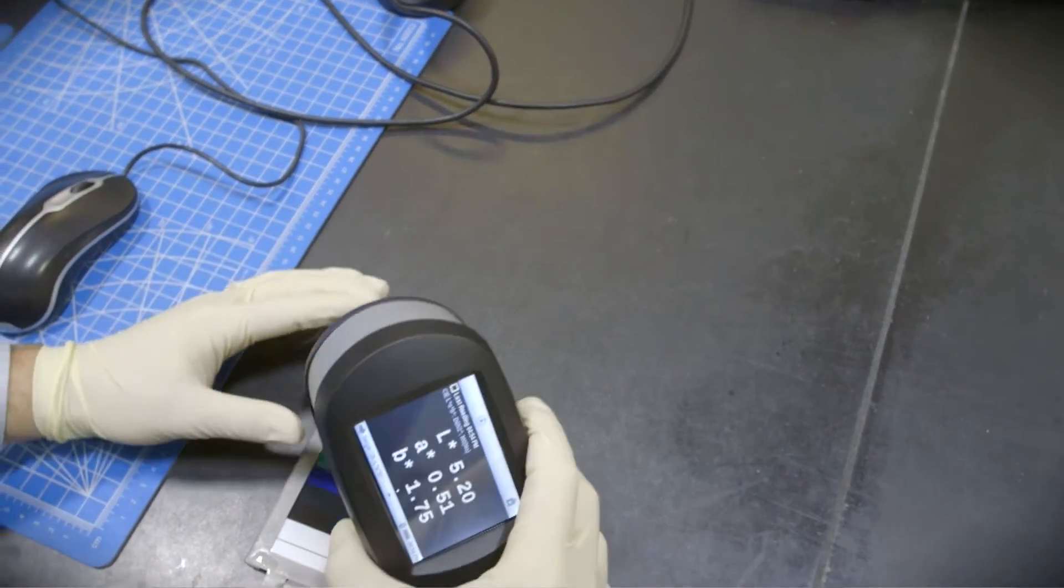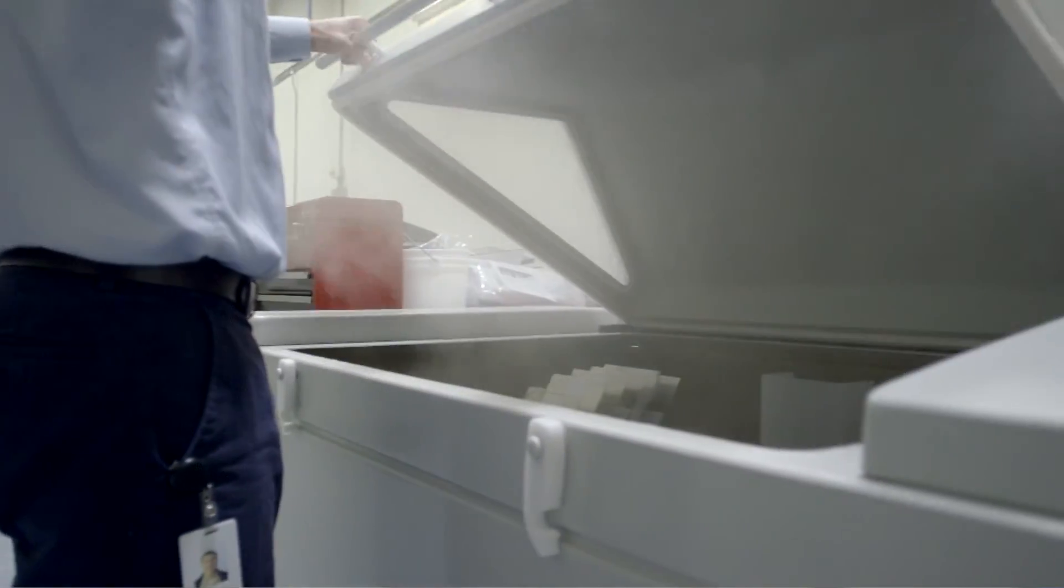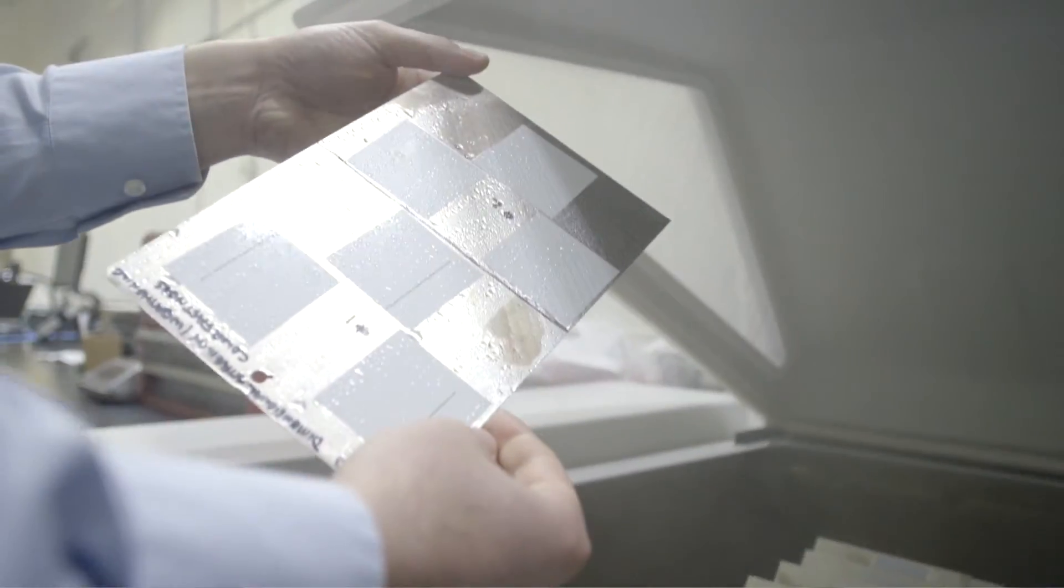We have color readers, gloss readers, and cyclic corrosion chambers if we're looking to evaluate salt spray or ocean resistance. Any other type of condition that a customer might be looking to evaluate, we can accommodate.